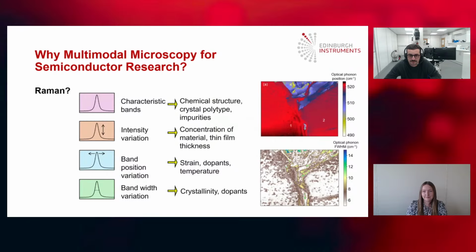Thanks, Angela. Good morning, everyone. Before we get into the case studies, I thought it'd be good to go through why you'd want to use multimodal microspectroscopy for research. So I'll explain a little bit about Raman and PL, maybe some other techniques. So first, let's look at Raman.